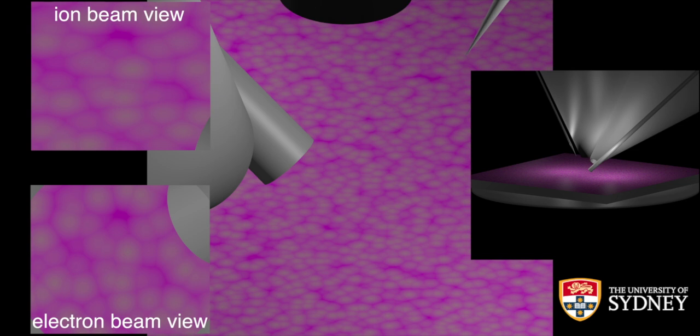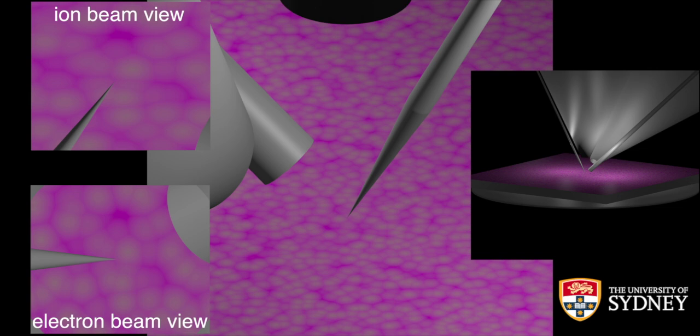So the actual lift-out part. What you need for that is to insert your gas injection needle, or microstage if you're in a Zeiss system, and your micro manipulator needle. The way you usually do that is you drop the stage down, and then you move in the gas injection system and you move in the micro manipulator needle. And then you move the stage to the micro manipulator needle, which is sitting at the coincidence point, not the needle to the stage. So stage to the needle, not needle to the stage.